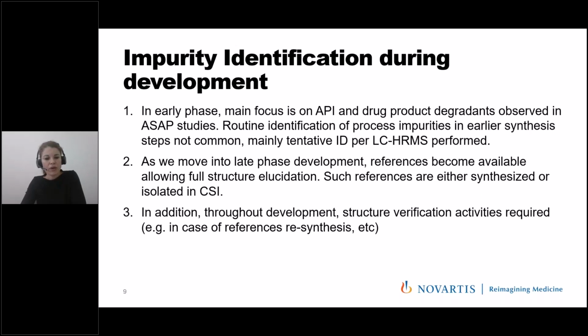In addition, throughout development, we are also involved in different structure verification activities. For example, if we have a resynthesis of a reference that we need to assess that this is again the right compound. So beyond the elucidation, several verification activities are ongoing in parallel.